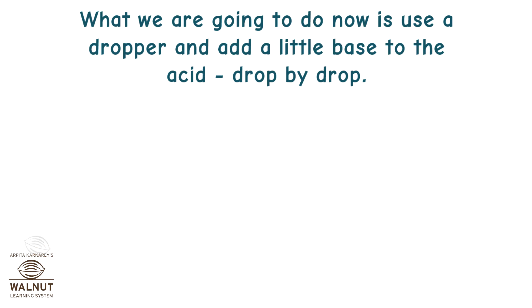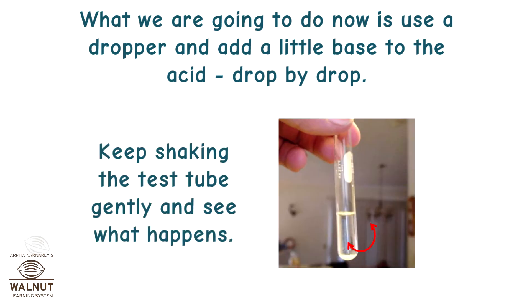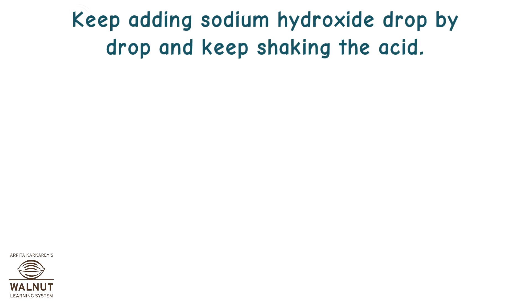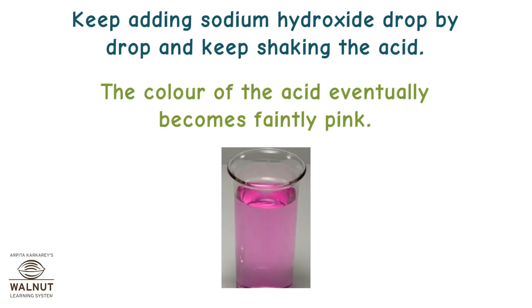What we are going to do now is use a dropper and add a little base to the acid drop by drop. Keep shaking the test tube gently and see what happens. Keep adding sodium hydroxide drop by drop and keep shaking the acid. The color of the acid eventually becomes faintly pink.